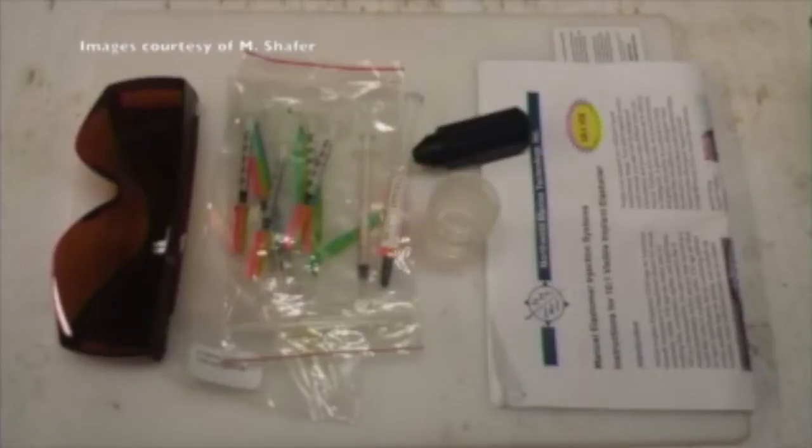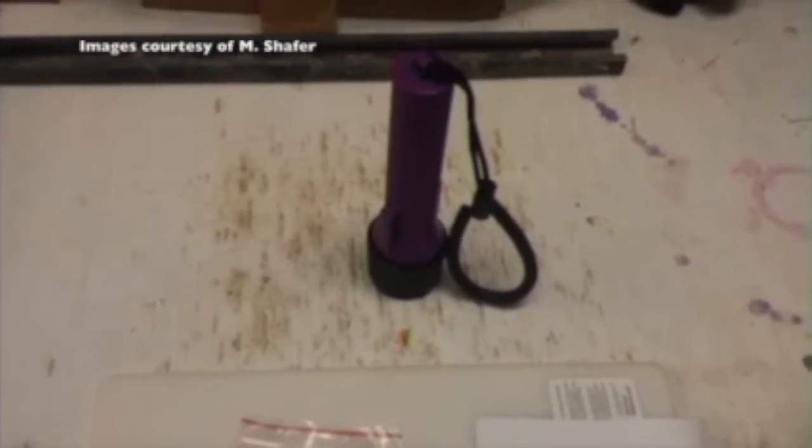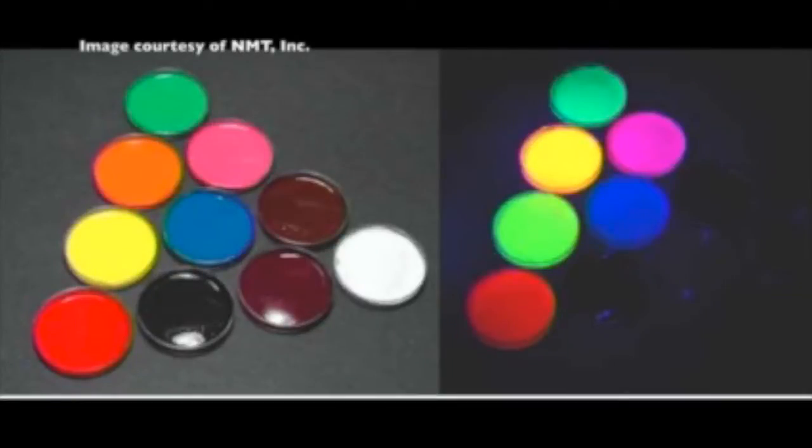The basic components of a VIE kit include elastomer and curing agent vials, UV glasses, mixing cup, safety applicator and application syringe, and UV flashlight. The elastomer comes in a variety of colors.